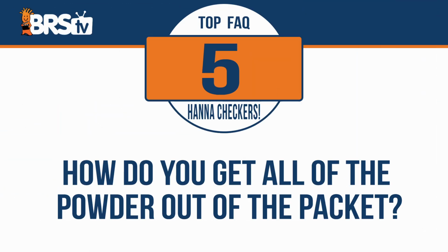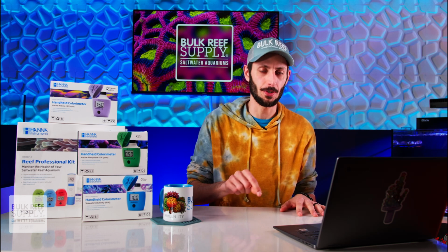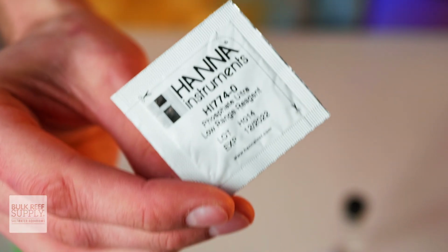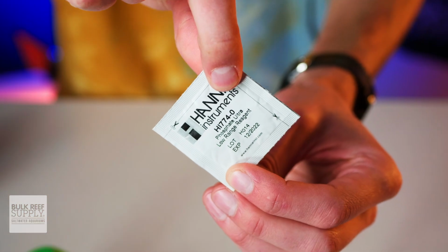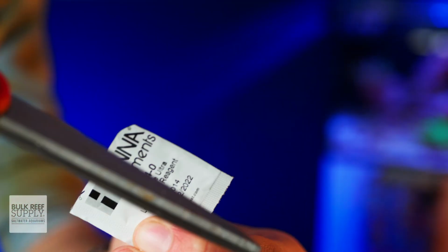How do you get all of the powdered reagent out of that little packet? This question gets asked a lot, and there is a simple trick that makes it a super easy and mess-free transaction. When you look close, each packet has a dotted line to cut across. First, grab the edge of the packet closest to the middle of that dotted line, and then give it a really good shake to get all the powder down to the opposite end. Next, use a pair of scissors to cut along that line.